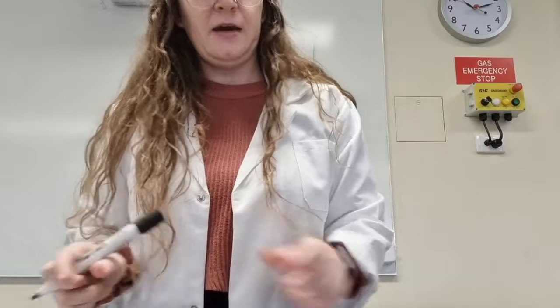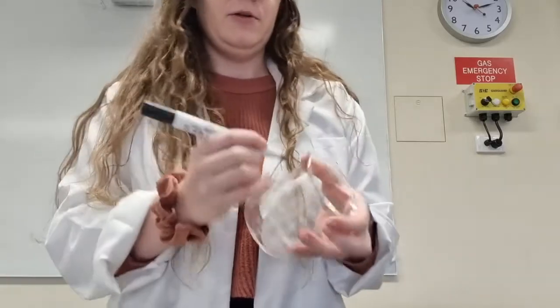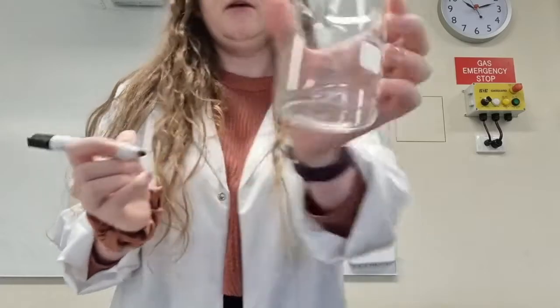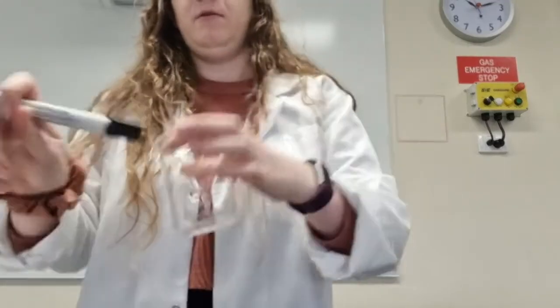So I'm up to step 2 because you've already copied your table. I'm going to pour copper sulfate solution into one of the beakers until it reaches 50 mils, and I'm going to label that blue. So I'm going to do that now. I'm going to use this beaker multiple times throughout the prac. So I'm going to pour copper sulfate in.